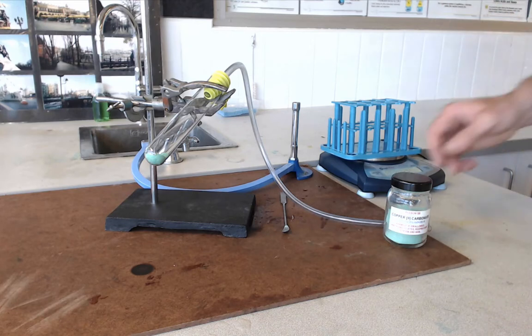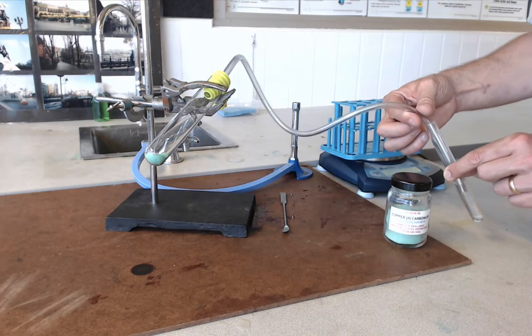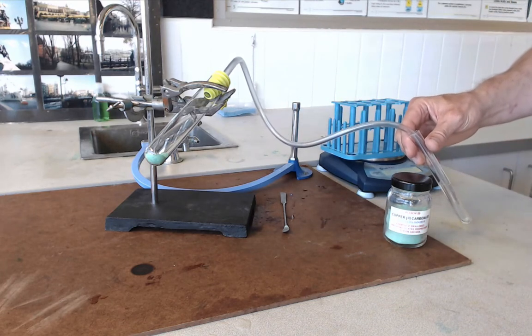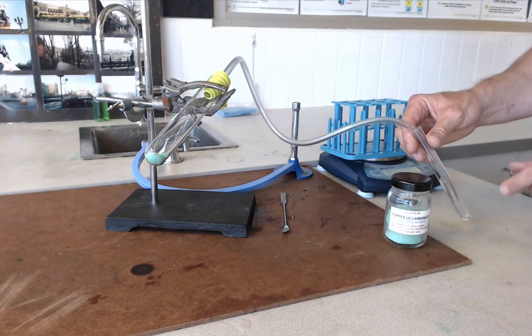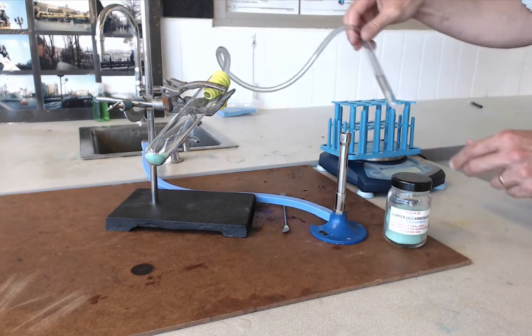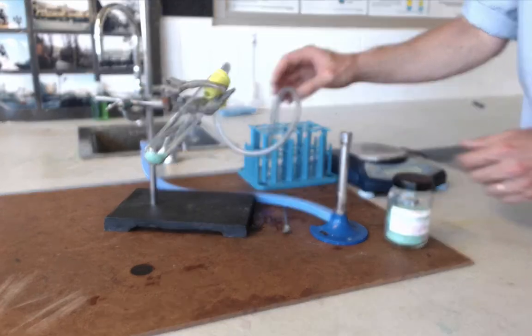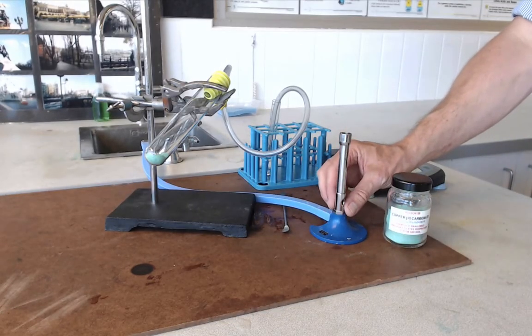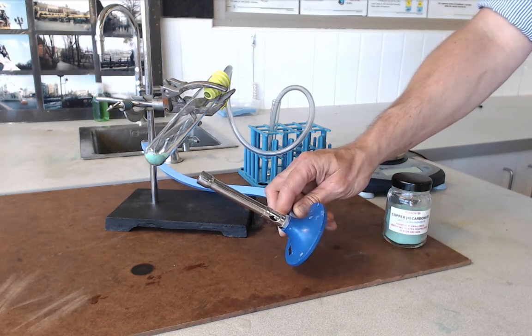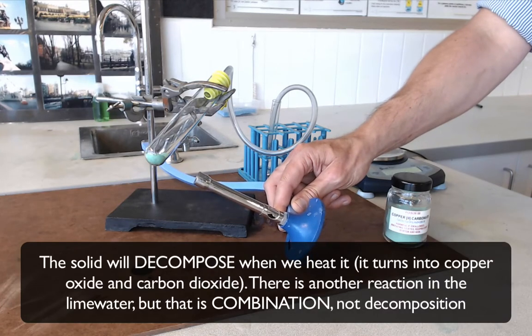Put the delivery tube into the lime water so that any gases produced from this reaction have to pass through it. We are going to heat this tube quite strongly, but not too strongly — use a medium flame on the Bunsen, so the air hole is about half open. We can just rest the test tube rack in there and direct that flame towards the solid in the tube.